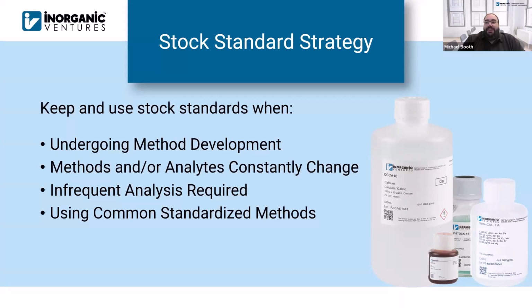So again, you might need a wide variability in the standards that you can put together for these different applications. Also, if you're a lab that doesn't do ICP analysis very frequently, there are labs that will run the ICP once a week or once every other week. They'll batch up samples, and they don't run the ICP every day. It's a very infrequent test for that location.